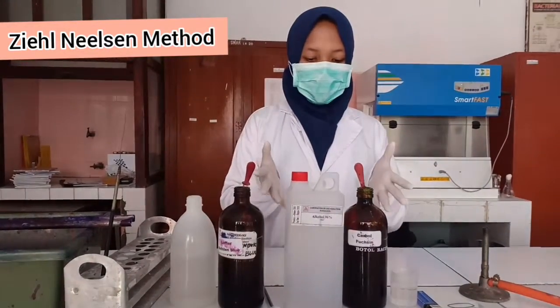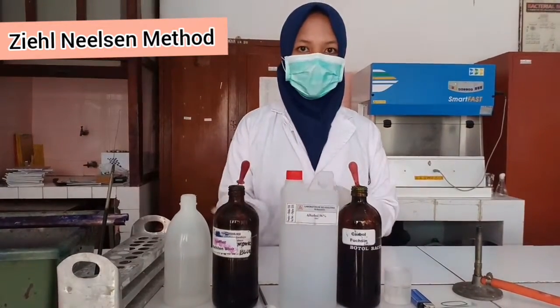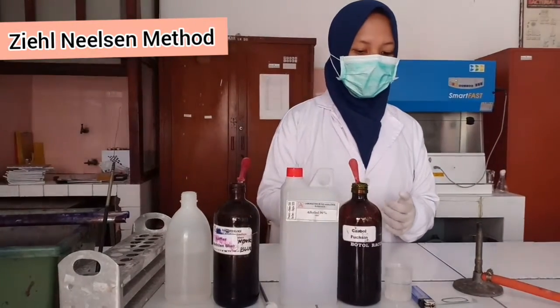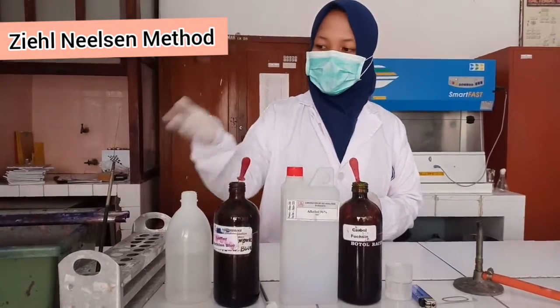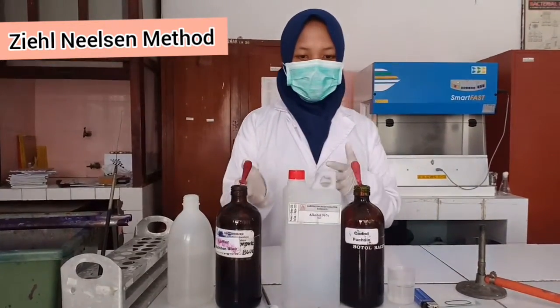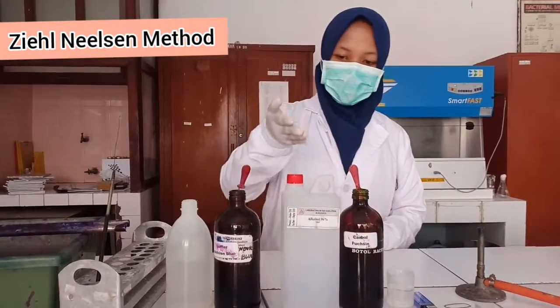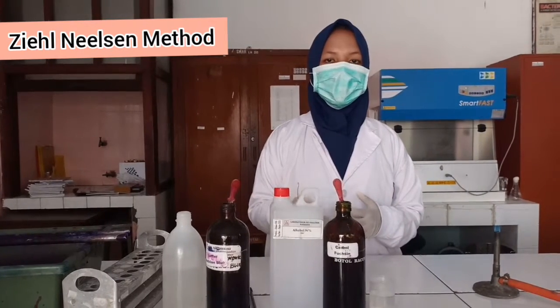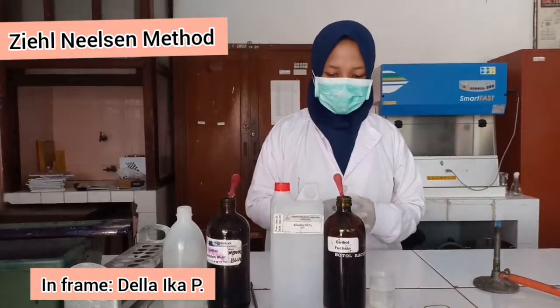And now this is acid fast staining using the Ziehl-Neelsen method. The first materials that should be prepared are an object glass, sputum samples, a wire loop, a pasteur pipette, and a Bunsen burner. And then these are the reagents for the staining of bacteria: carbolfuchsin, acid alcohol, and methylene blue. This is the procedure of acid fast staining using the Ziehl-Neelsen method.